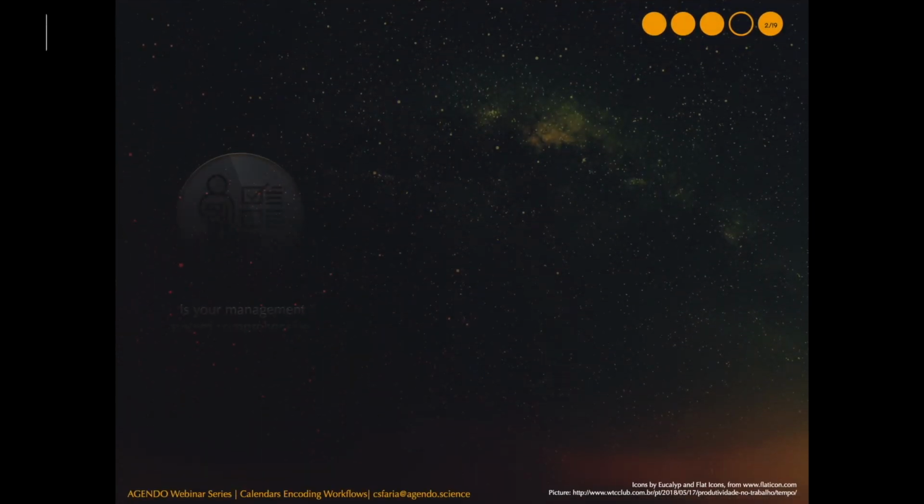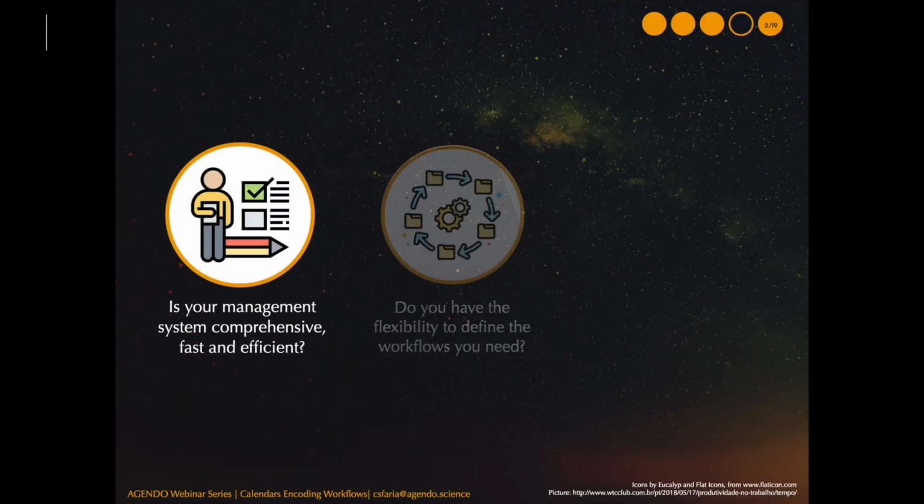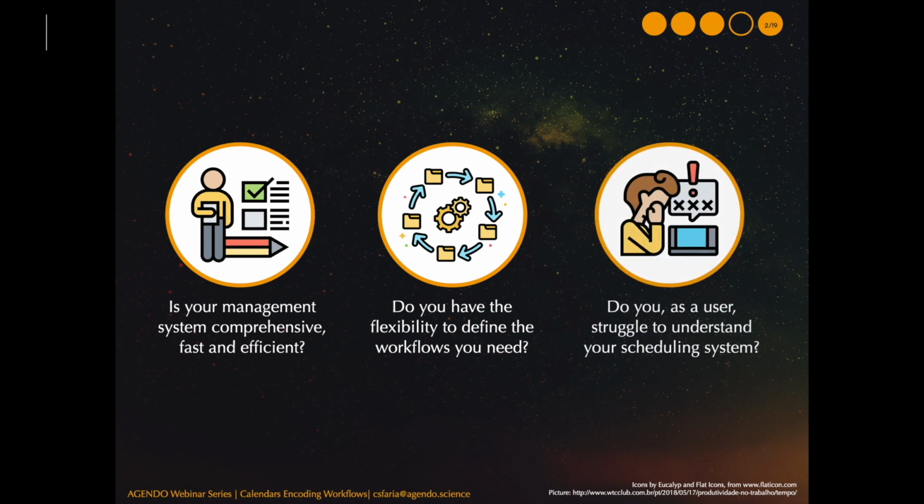So taking into account that some scheduling systems are not comprehensive enough to allow you to build the best workflows for your facility, or are not fast responding to your commands, leading to frustration and time waste, or are even not very clean and user-friendly, I would like to invite you to take a peek through Agendo's workflows to show you how comprehensive, fast, flexible, and user-friendly it is, enabling you to encode and optimize the workflows you want.